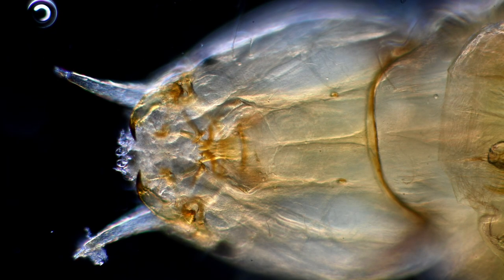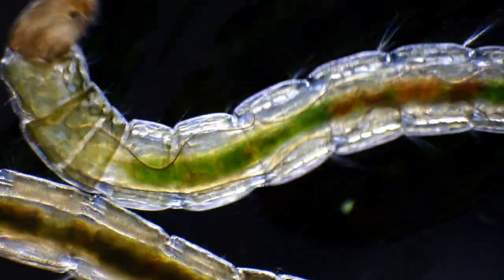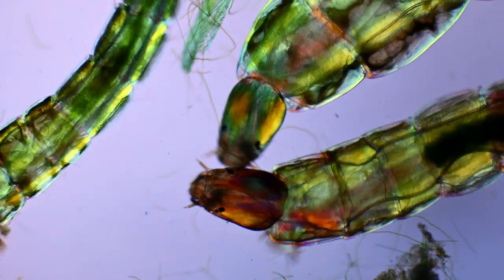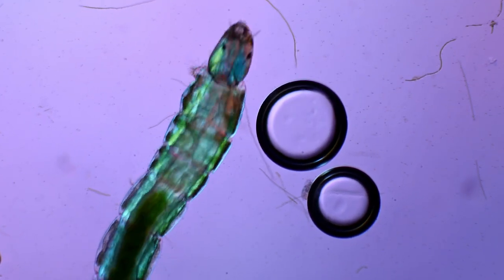Insect larvae might not sound like the most exciting animals in the world, but with a little trick we are able to make them look like microscopic aliens. To achieve this effect I used something called polarized light, which interacts differently with the different structures inside the larvae.